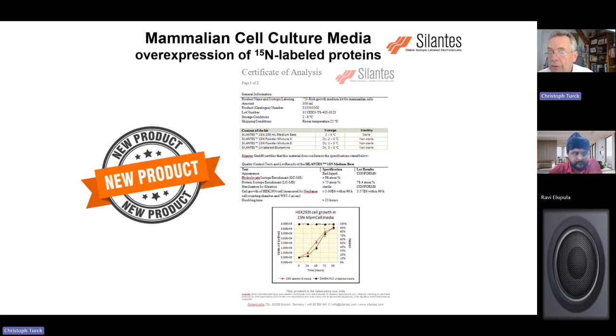And then again, you have to go one more step. The ratio of ratios gives you the relative quantification between case and control. So yes, you get of course mass spec data for both. You have to do a database search for the unlabeled peptide and also a database search for the 15N labeled peptide of the same sequence.